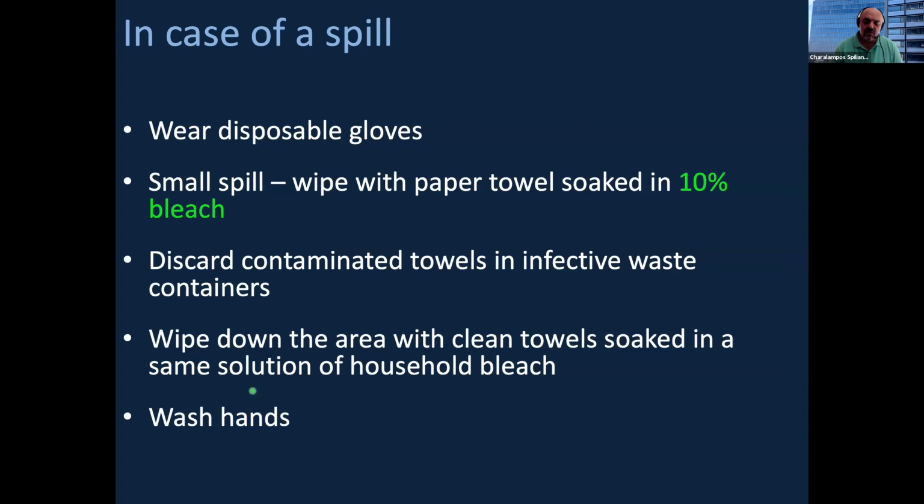Depending on the spill, you could ask them to get out, to leave the lab for a certain period of time, at least 20 to 30 minutes, closing the door, opening the windows, and let them come back after you are done with decontaminating the area.